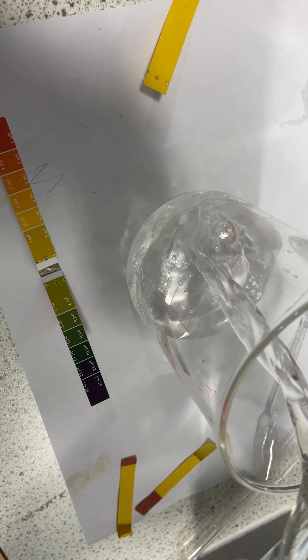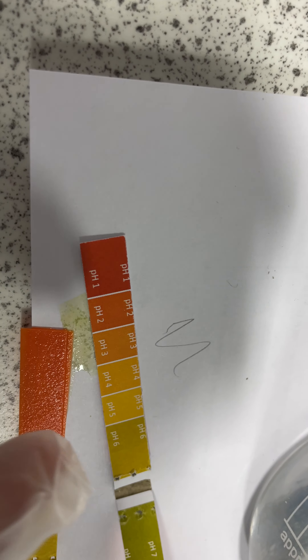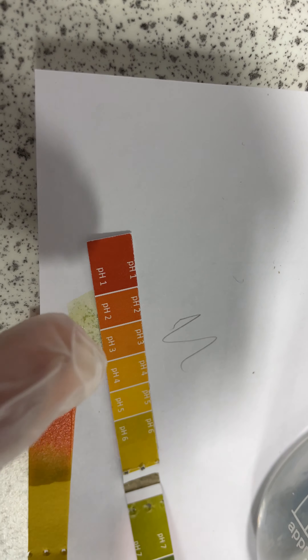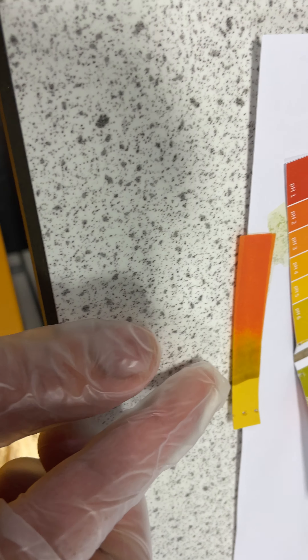I'm going to swap them around. So this is my acid and this is my water. If I put the water back in there and add some acid — taking a fresh bit of paper — place that in. We can see that goes clearly bright red/orange, so clearly in acid.